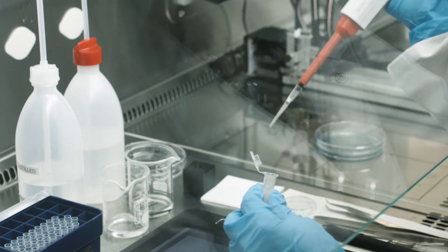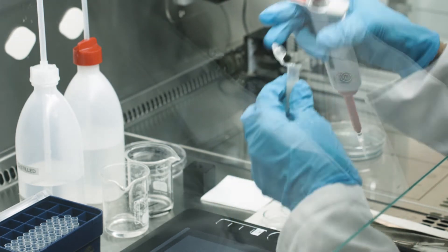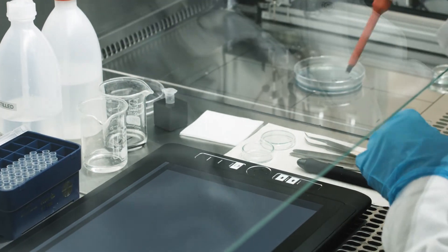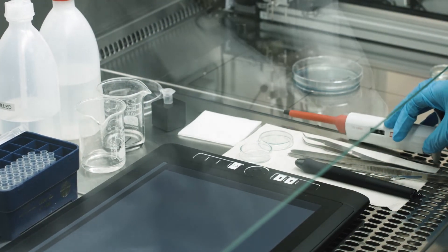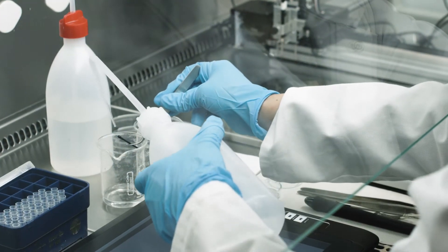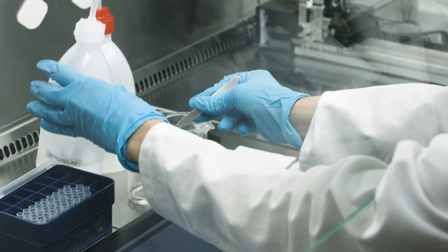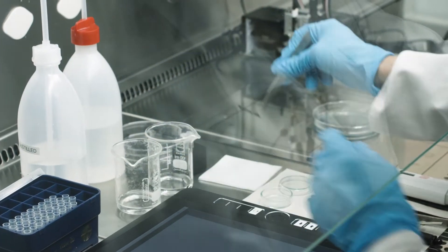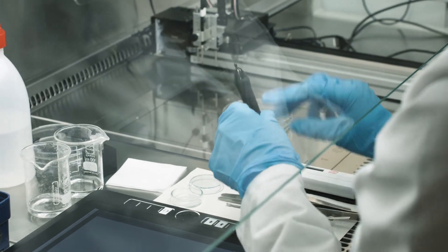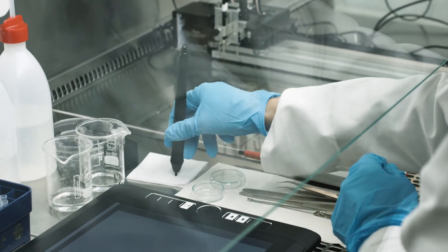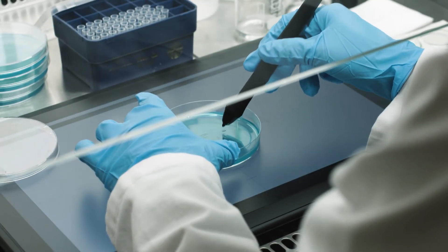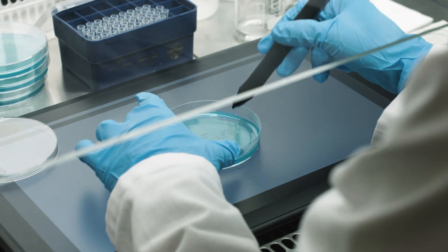In the first phase of research, we developed BioInk, BioPen, and BioPad. Here you can see a sample of BioInk that contains living microorganisms. In the BioPen development, we tested various digital pen tips as well as medical and biological tips to combine with the digital pen. We dipped the pen tip into the living ink to draw and write on a nutrient agar plate that we optimized to combine with the digital tablet.